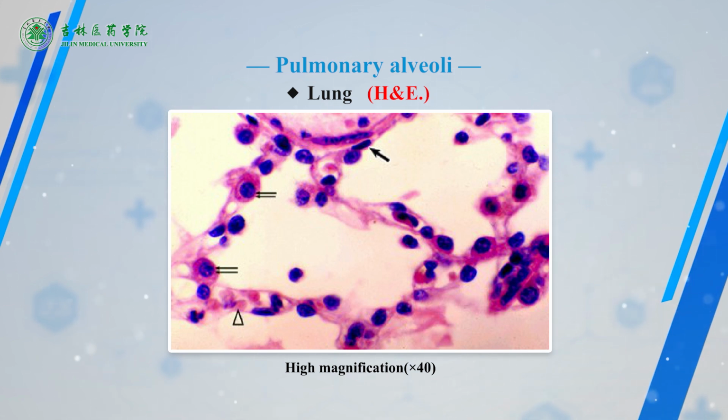It consists of two thin squamous epithelial layers between which lie capillaries and a little connective tissue with some macrophages. Free macrophages can also be seen in the alveolar cavities. The alveolar septum possesses abundant networks of blood capillaries that closely attach to the alveolar epithelium.